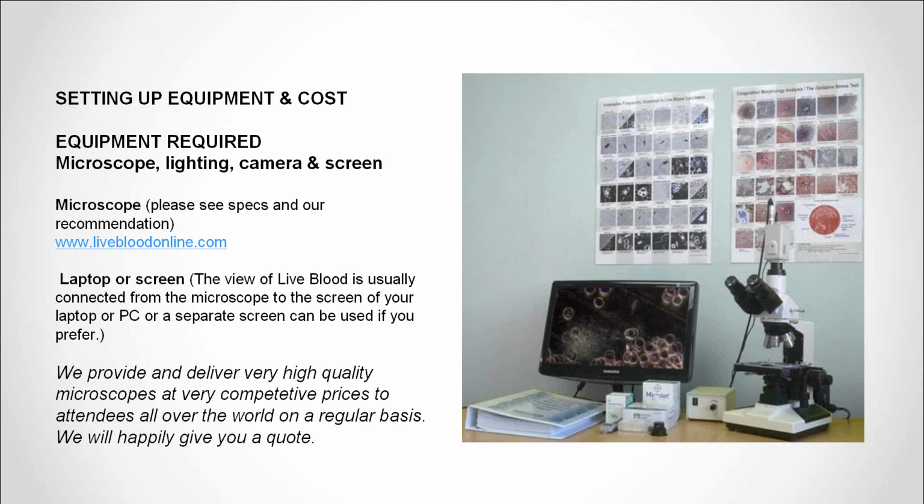Well, that's actually where it becomes quite difficult. It is quite a costly procedure to set up a live blood practice, mainly because of the cost of the equipment. And students do from time to time look for alternatives. But I've been involved with live blood analysis now for nearly 15 years, and we've done a lot of work researching all the different types of microscopes available on the market, from the top of the range, well-known brands, right down to the cheaper microscopes from China.